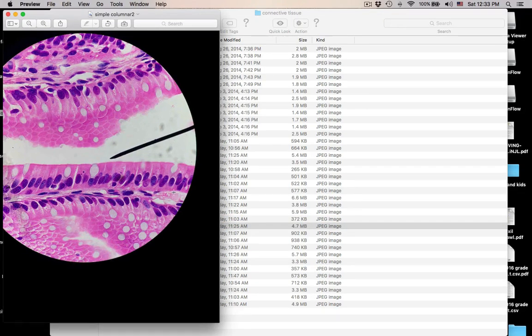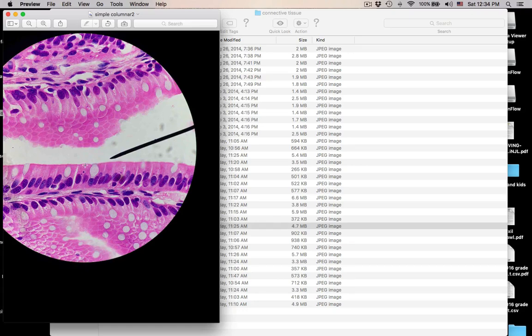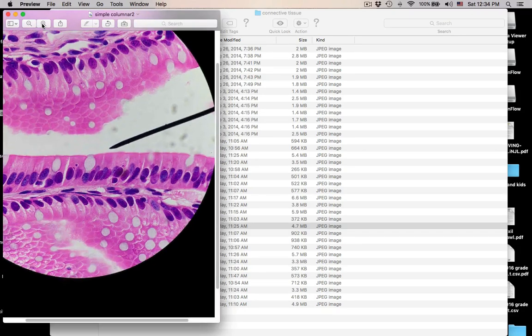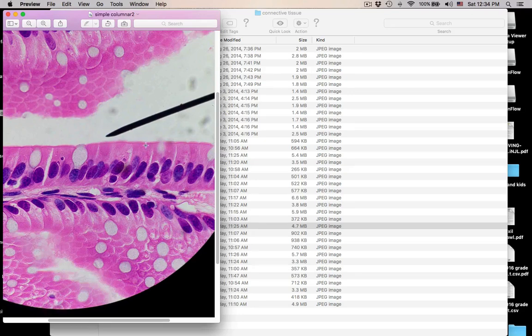Here's another one. Pointer in the lumen, basement membrane down here, connective tissue below. Look at the elongated nuclei — columnar. These white things are goblet cells. You can see the fuzzy border of microvilli up here. Once again, this is simple columnar with microvilli and goblet cells.